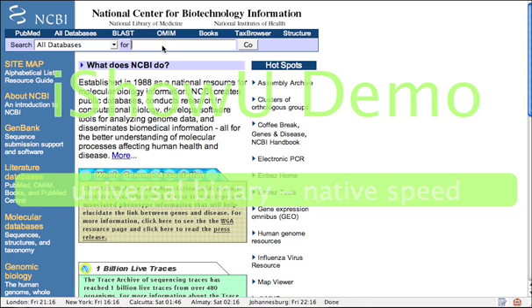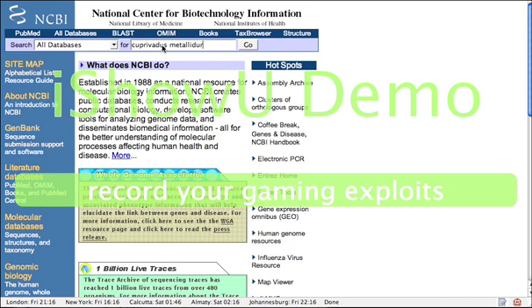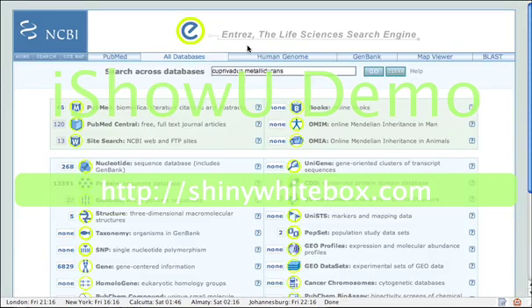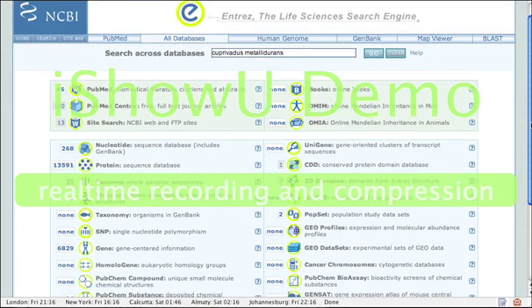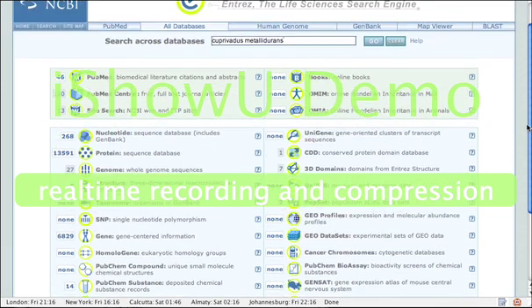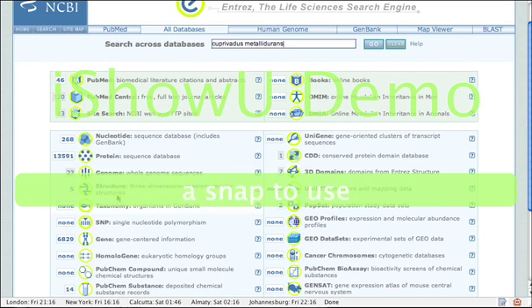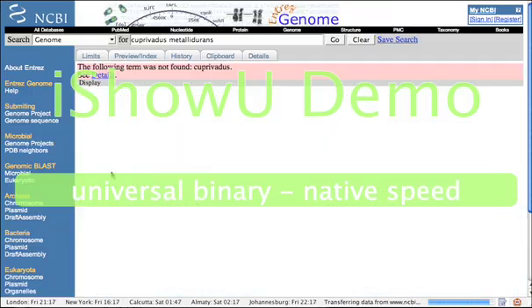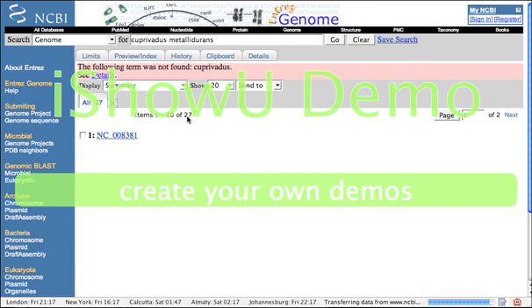So we type in the name of the bug, making sure that we get the spelling right, and click Go. What we basically get is a summary of that keyword and its presence across the NCBI databases. We are happy to know that there are 27 genomes that match the name Cupriavidus metallidurans. If we now click on the Genome tab, we get a list of the 27 genomes pulled up with that particular keyword.